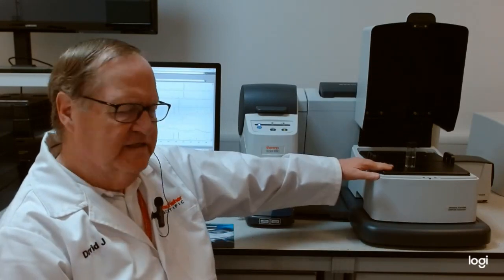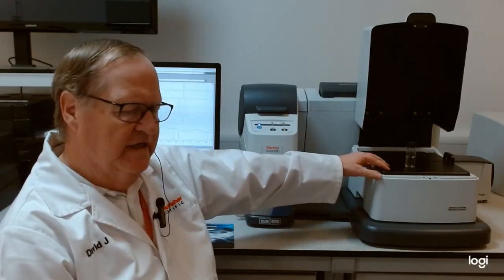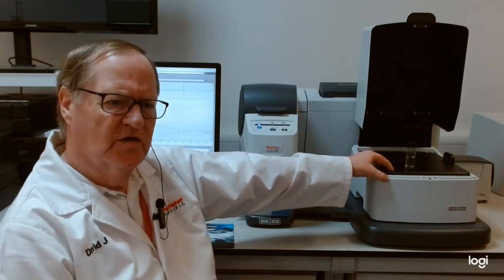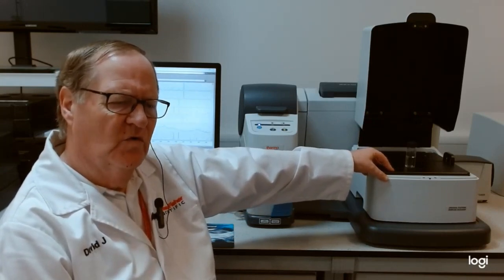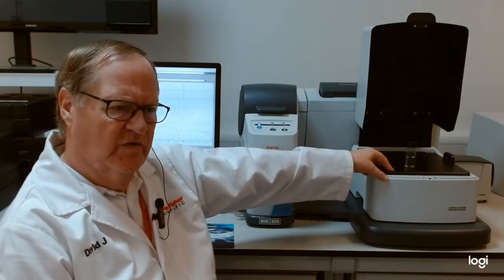The top plate here is also swappable. This is the standard top plate for general sampling. One advantage and unique feature of this top plate is the fact that you can perform what's called VDPS — variable dynamic point sampling.